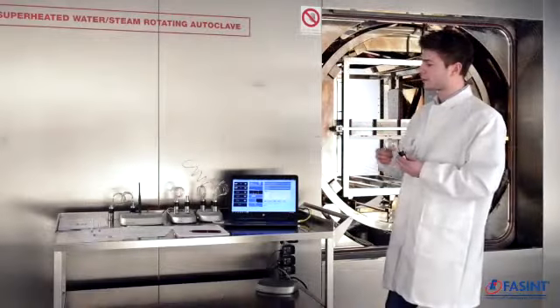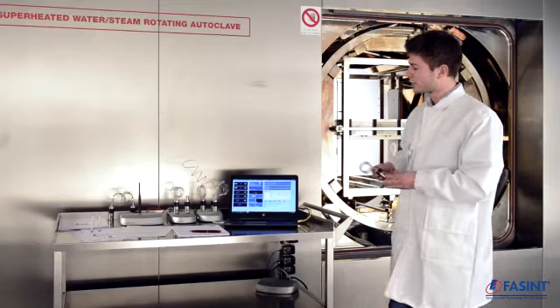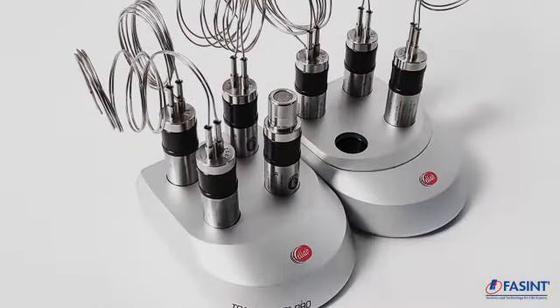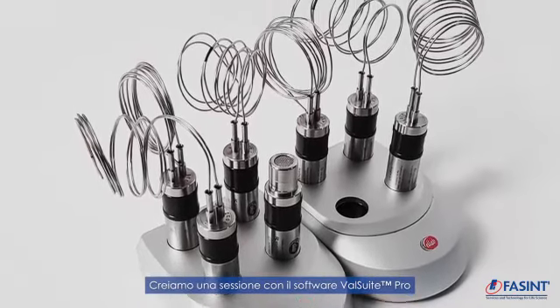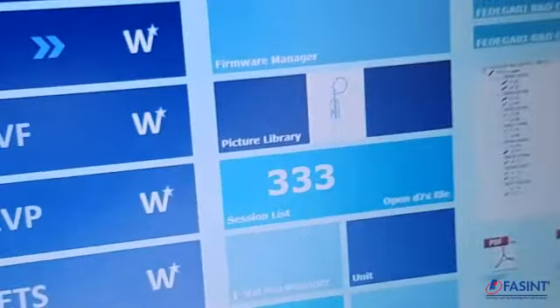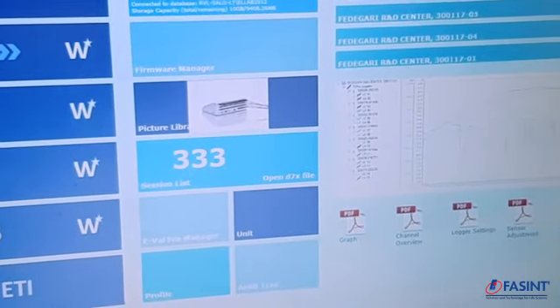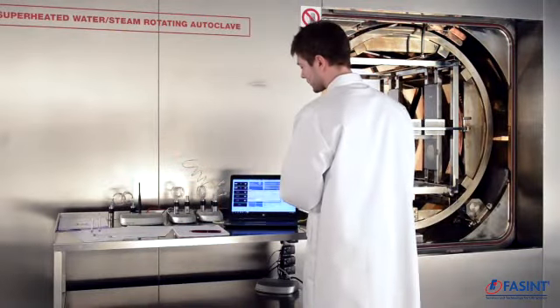Once you have your BellSuite software up and running, you install your loggers and are ready to start. I will show you a few steps in the software. You go inside the software and start a new session, clicking on the TrackSense Pro setup button.